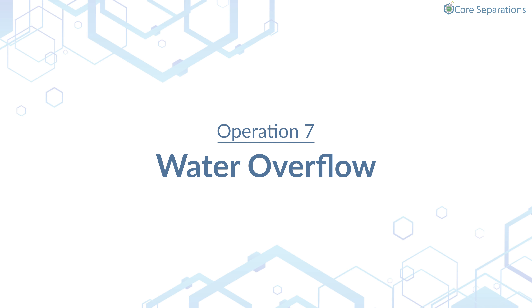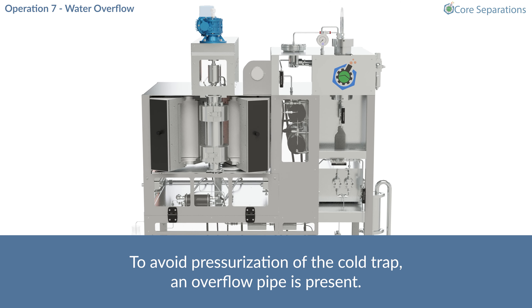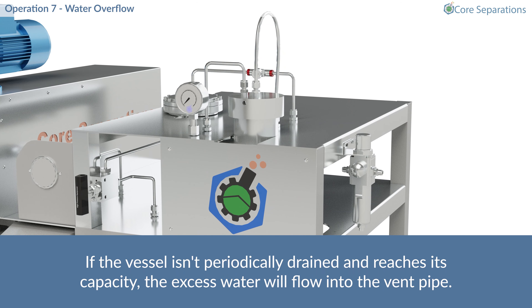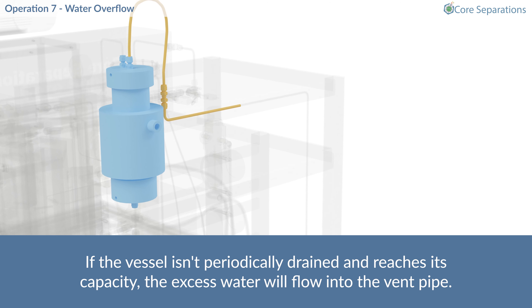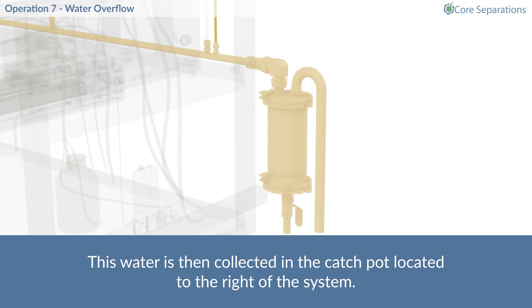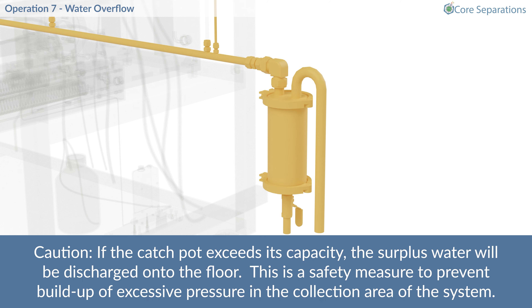Operation 7 – Water Overflow. To avoid pressurisation of the cold trap, an overflow pipe is present. If the vessel isn't periodically drained and reaches its capacity, the excess water will flow into the vent pipe. This water is then collected in the catchpot located to the right of the system. Caution! If the catchpot exceeds its capacity, the surplus water will be discharged onto the floor. This is a safety measure to prevent build-up of excessive pressure in the collection area of the system.